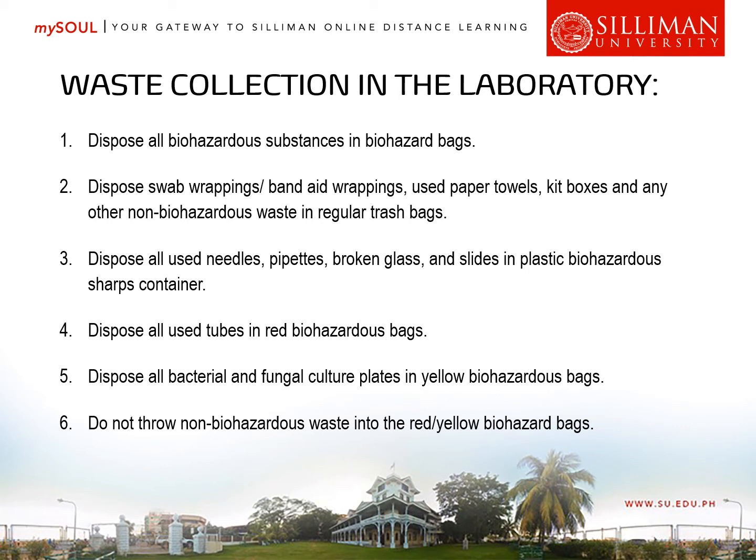And number six, do not throw non-biohazardous waste into the red or yellow biohazard bags. Always remember our non-biohazardous waste that are dry are disposed in black colored containers, whereas non-infectious wet waste are placed inside green colored waste containers.